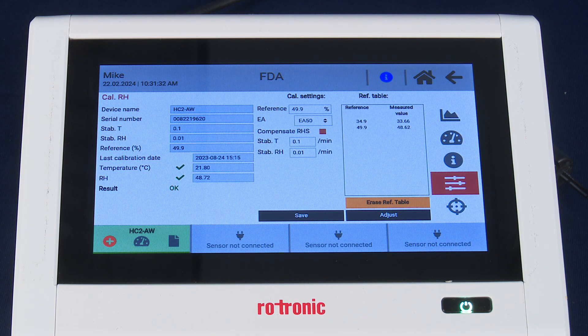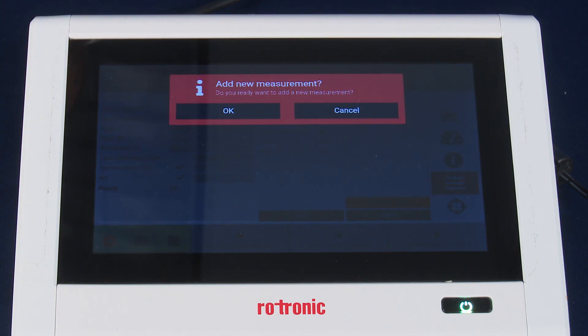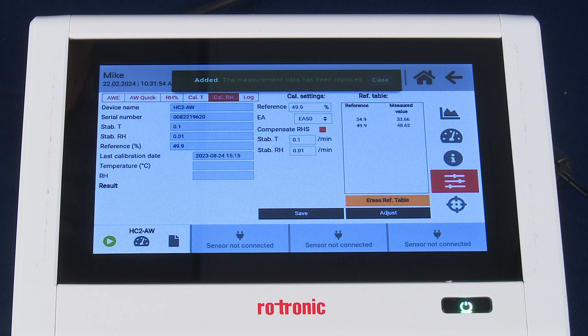From here, we want to complete with our third humidity standard. It's important to note we do not hit the adjust button at this point — it is only until we've completed all measurement points that we will adjust. We will add an additional measurement point again with the orange plus icon and confirm OK. We've now added the next measurement point and can complete our sample preparation as before.